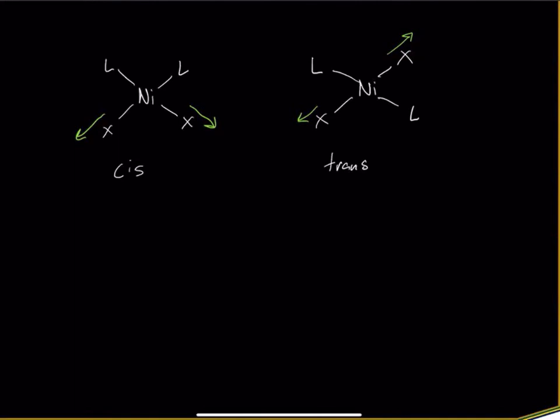And then if you have a square planar complex, you're going to analyze, can I differentiate between cis and trans? Right? What information do I have that I can use that might help me identify these different orientations or these different geometries of my structures? Right? Those are the big questions that we're digging into for this lab. Is how can we identify and support our identification of these geometries that we have in front of us?